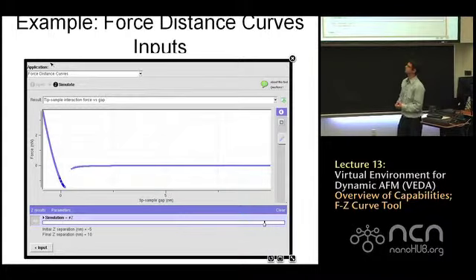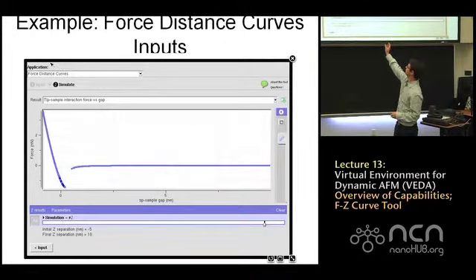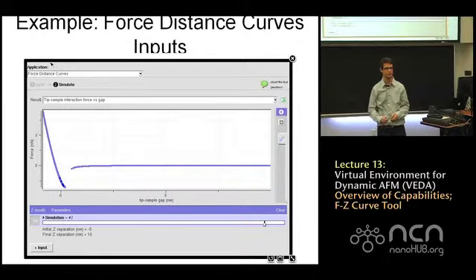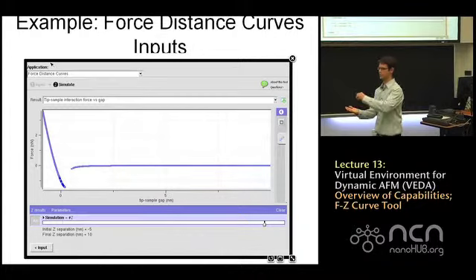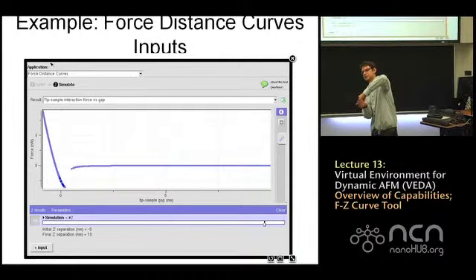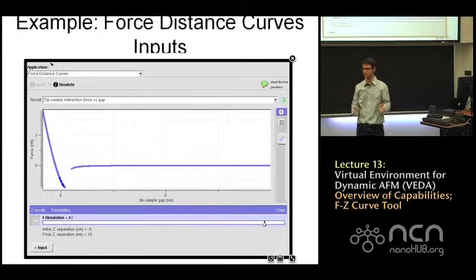And again, if we plot force versus gap, we still have a separation where we don't have any information. There's still a region where the cantilever goes from contacting the sample as we're retracting and then it pops off the sample. There's still a range of tip sample gaps where we don't measure any reliable information.